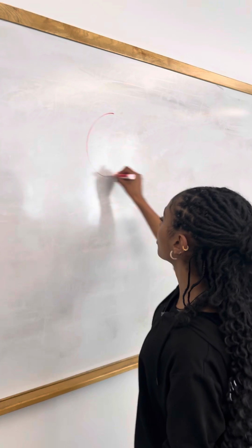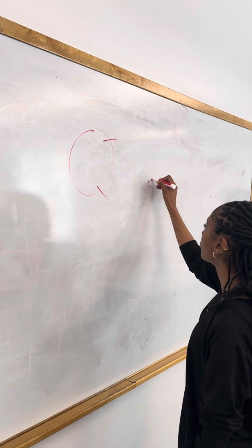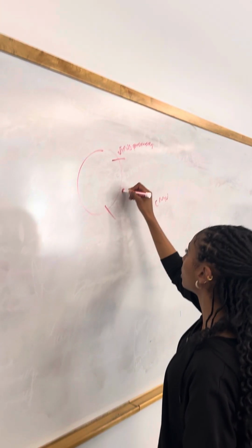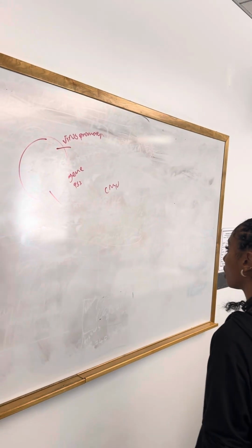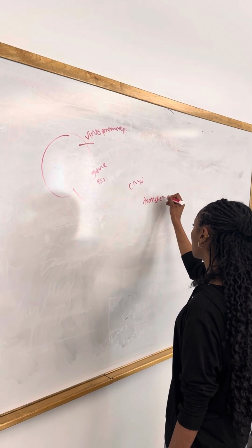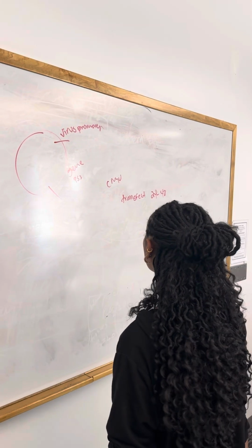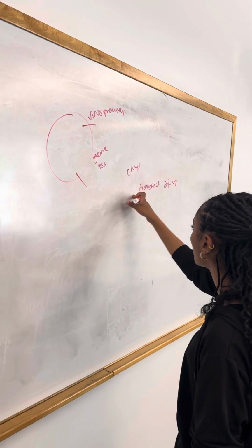So for the overexpression, we're gonna buy a plasmid vector. In this case, it's gonna be a CMV, and we're gonna use a virus promoter. And then the gene of interest, which is P53 in this case. So what we're gonna do is we're gonna transfect it, and then we're gonna wait 24 to 48 hours to make sure that we're gonna get a result from what we transfected.